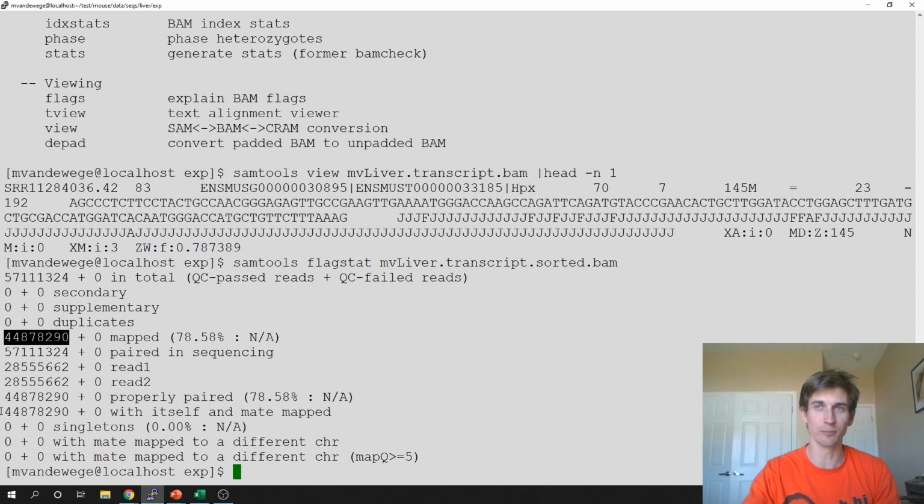So all that we have are the paired reads and how many of those paired reads mapped appropriately. Here it's about 78%, which is pretty nice. I have definitely worked with BAM outputs that were between 40 and 50%. In those cases, when you already have similar genomes, you tend to see a lot of reads mapped to mice and humans and other model organisms.